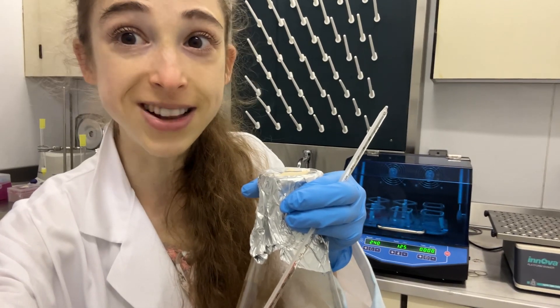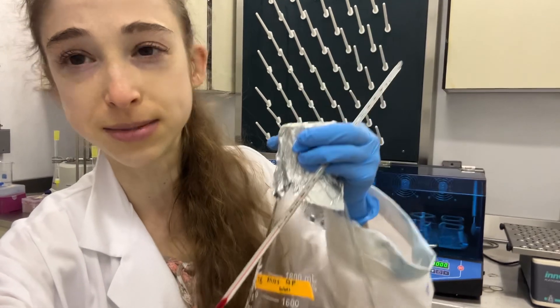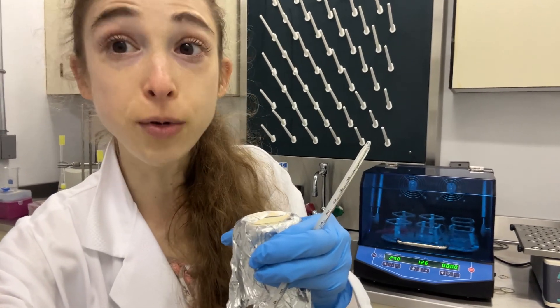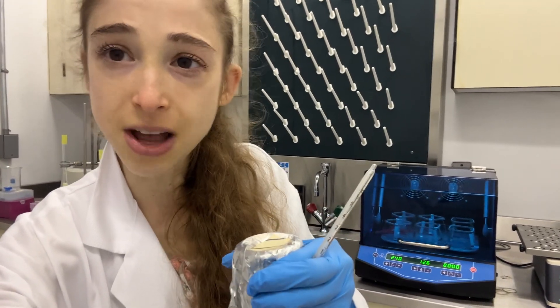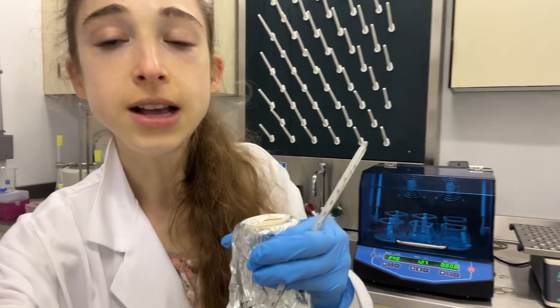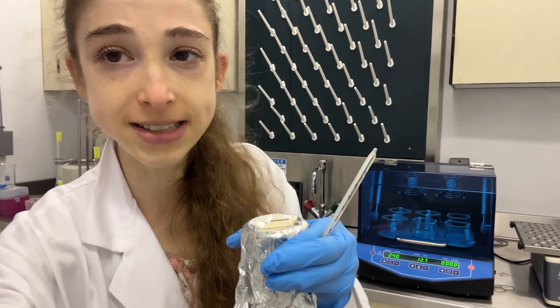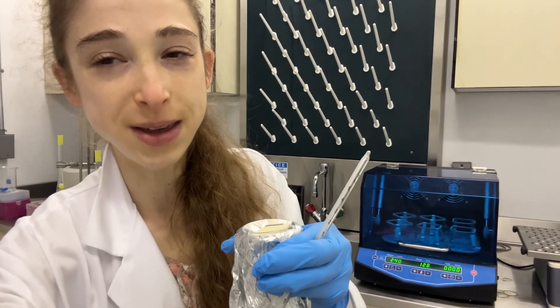When you have an incubator that says it can go from ambient, or room temperature, up to some high degree, well now your ambient is lower, so you're able to get to a lower temperature. This is really great if you don't have one of those incubators with a refrigerating system that can go below the ambient temperature.